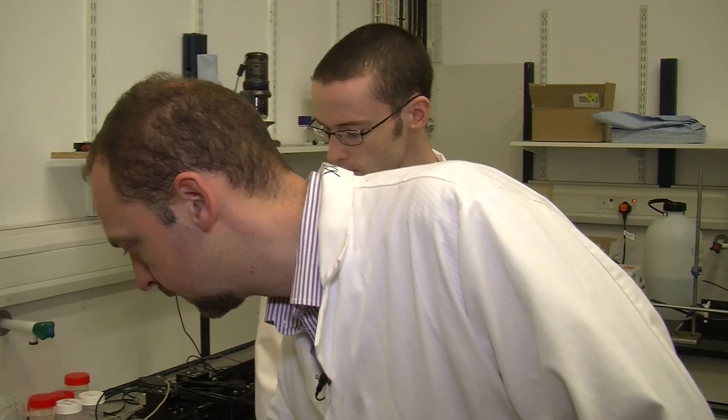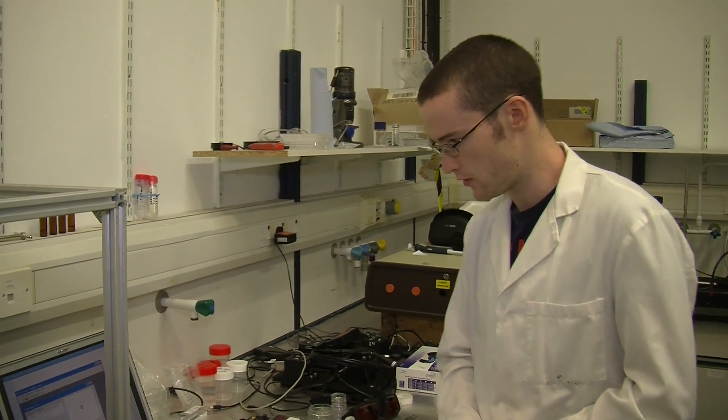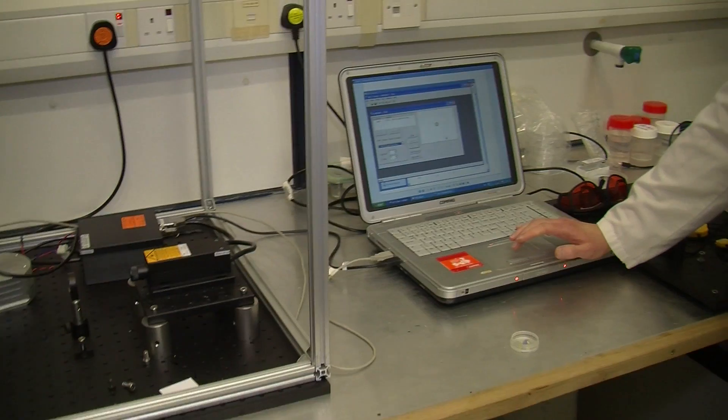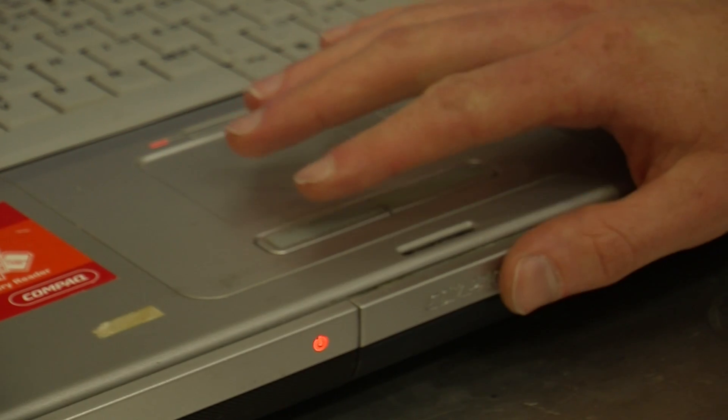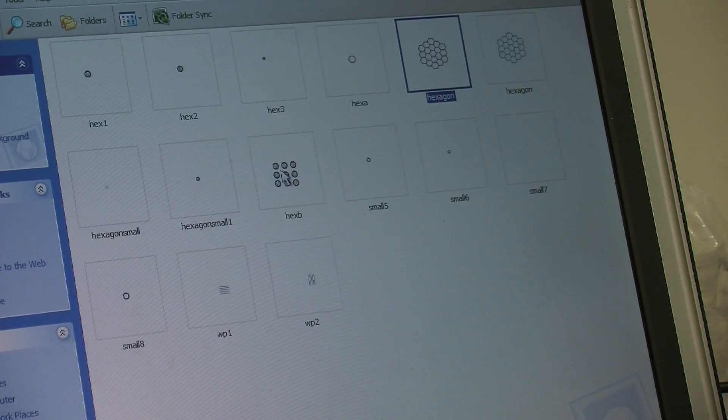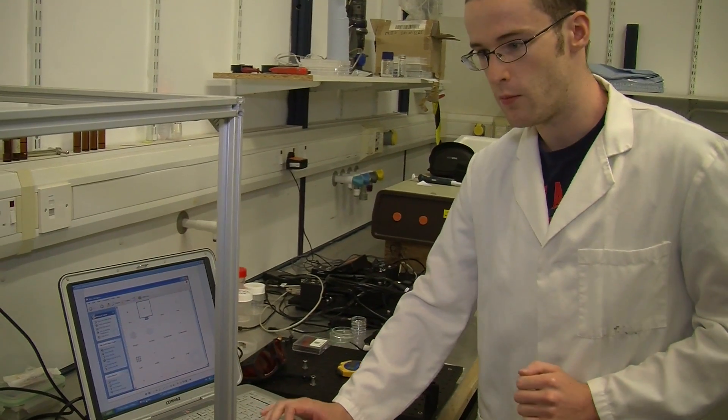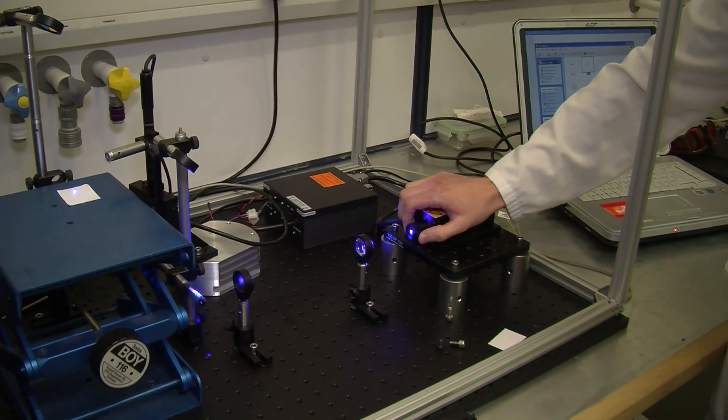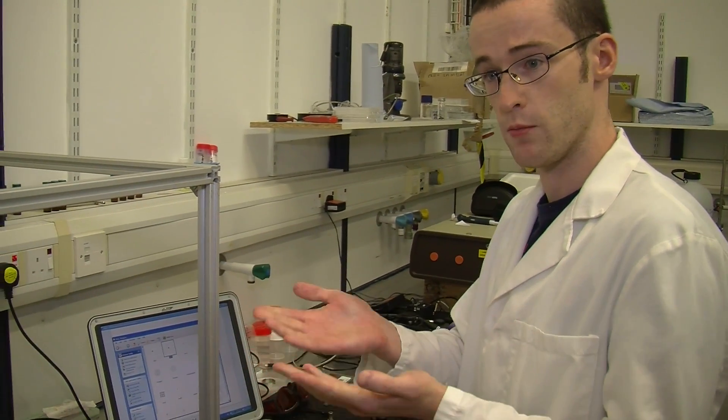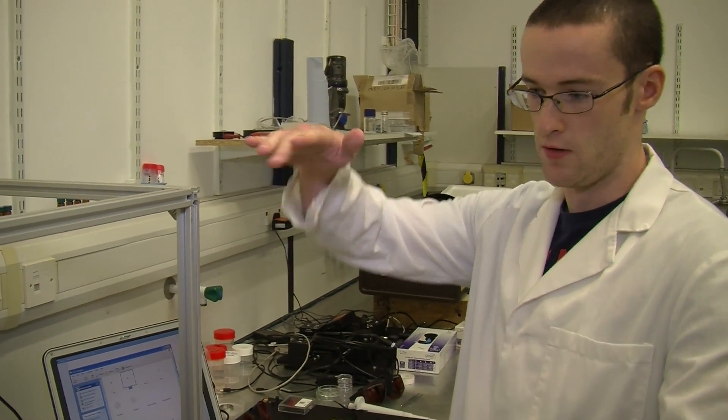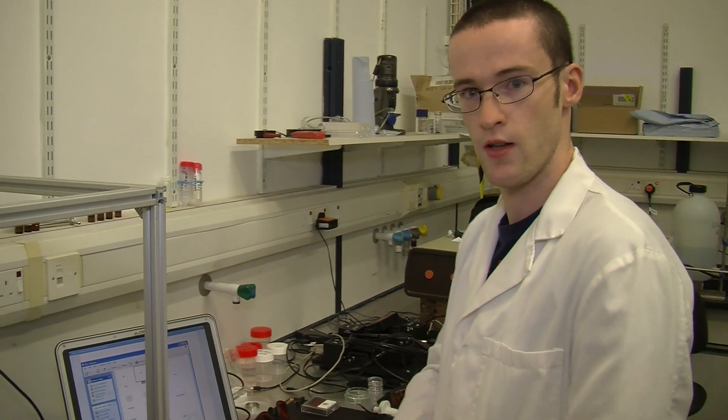One of the PhD students in the group, Andrew Gill, is involved in actually making the lithography devices. The technique we use to produce the structure is very simple - it's a projection micro stereolithography system. We put a bitmap into the control computer, for example this honeycomb structure here. You can see it's got the outer circle and then the internal structure. We put this into the control system, then project that using the laser into the polymer. You see the image on the screen is formed on the sample here. Then by adding more polymer and moving the sample stage down, we can write out a tube in a vertical direction. It's very simple and very user-friendly - you simply add a bitmap, project it and run the program and it will write your tube for you.